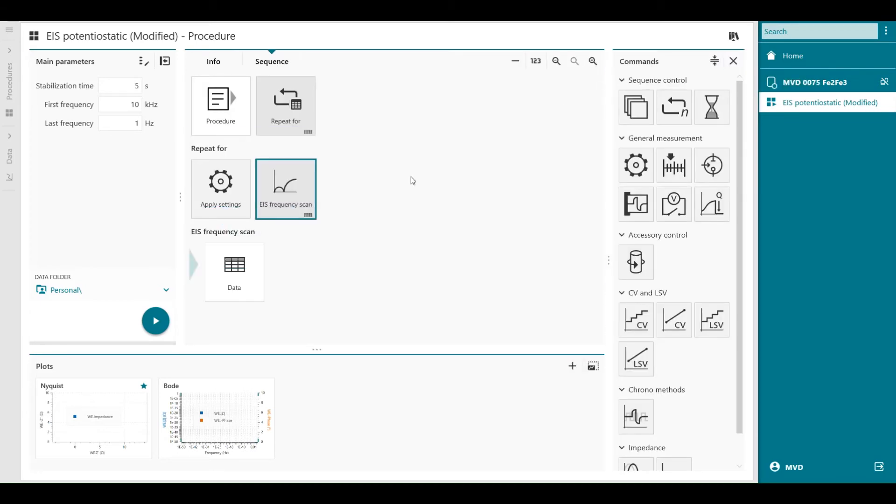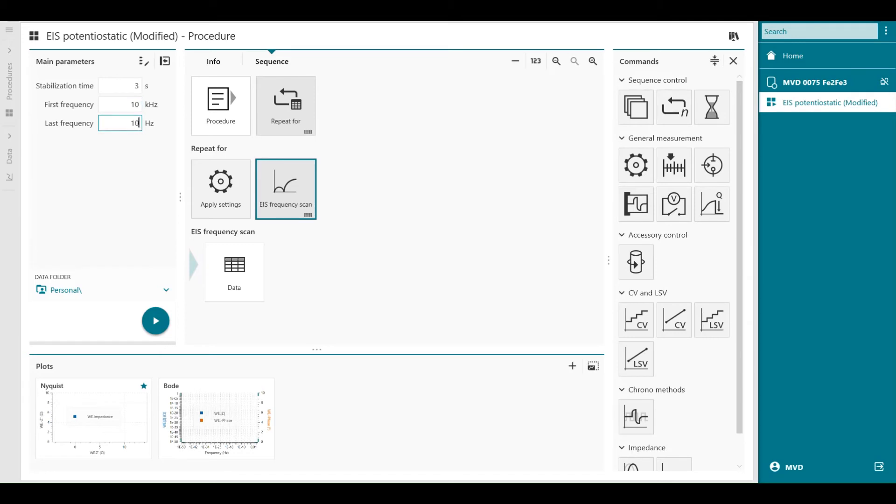Now my procedure is set. I can still modify the stabilization time, let's say to three seconds, or my first frequency is 10 kilohertz, last frequency is 10 hertz. So that's all still available in the main parameters.